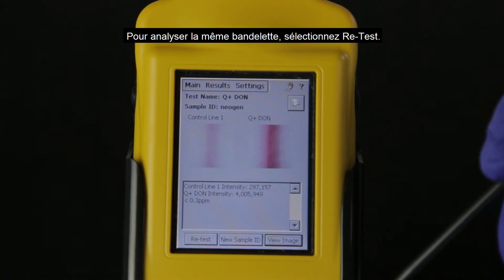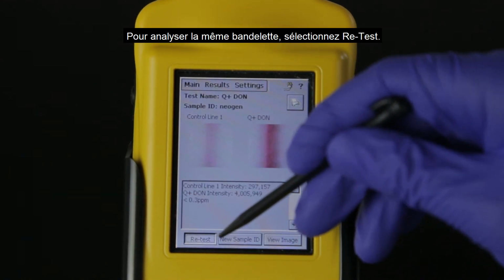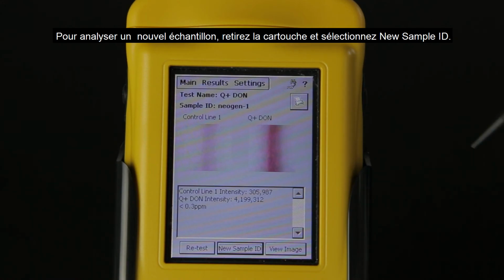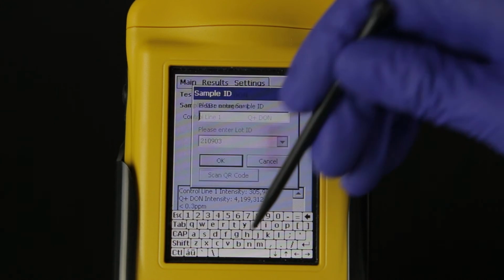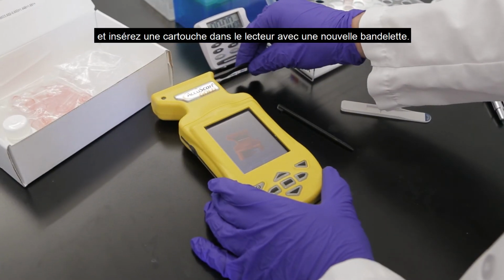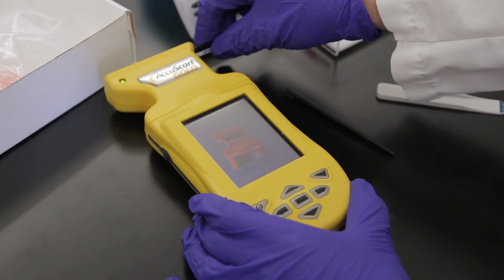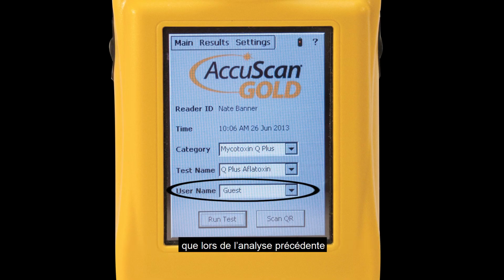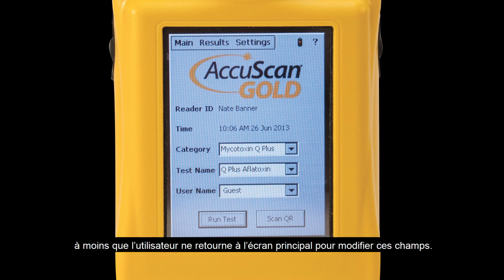To reread the same strip, select Retest. To test a new sample, remove the cartridge and select New Sample ID. Input the new sample name and insert the new test strip in the cartridge into the reader. The test category, type, and user remain the same as the previous test, unless the user returns to the main screen to edit these fields.